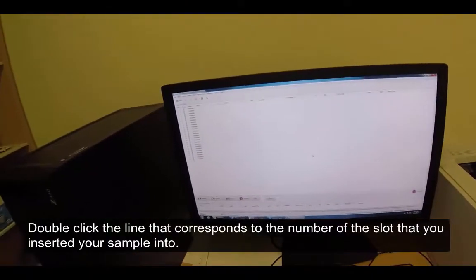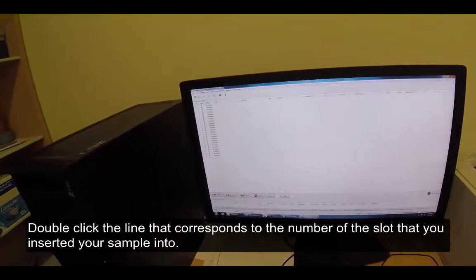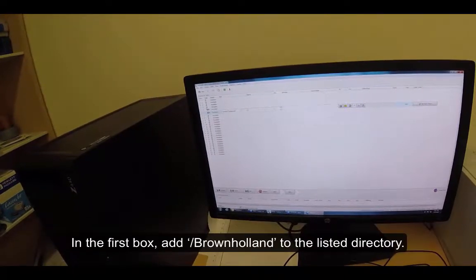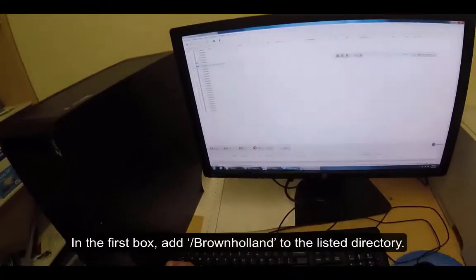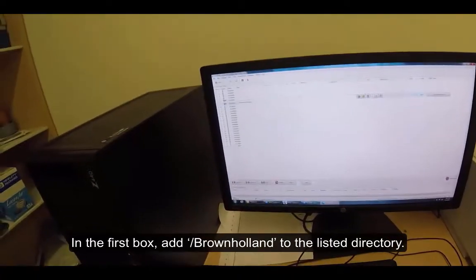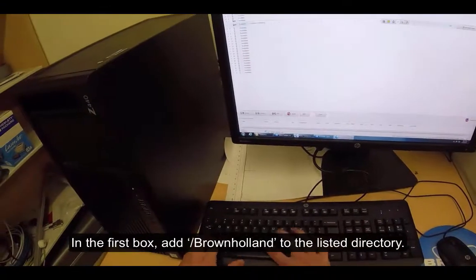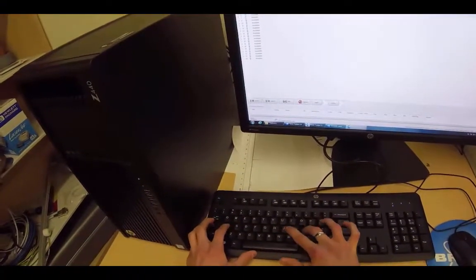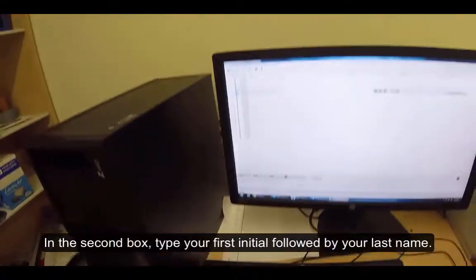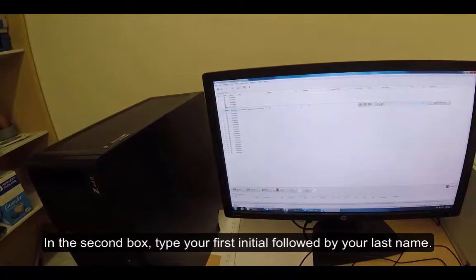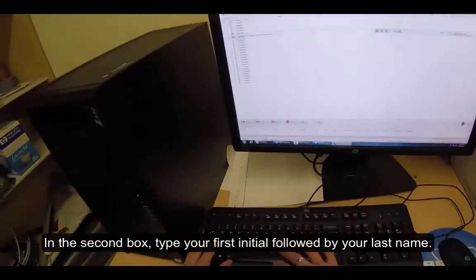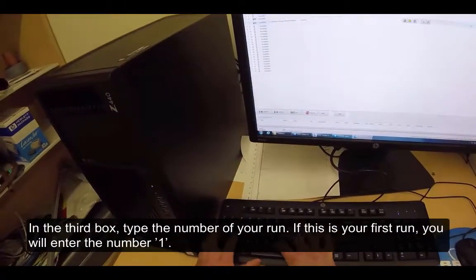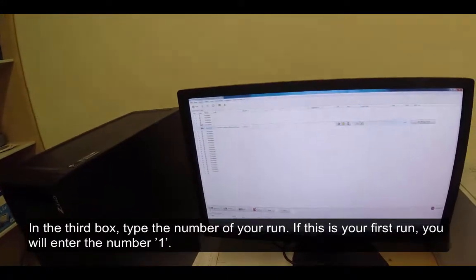Double click the line that corresponds to the number of the slot that you inserted your sample into. In the first box, add forward slash BrownHolland to the listed directory. In the second box, type your first initial followed by your last name. In the third box, type the number of your run.